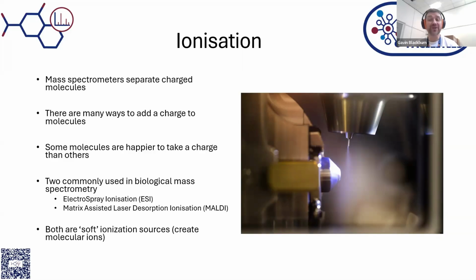So you want a soft ionization technique, and that's why ESI and MALDI have really taken off in the biological mass spectrometry area.